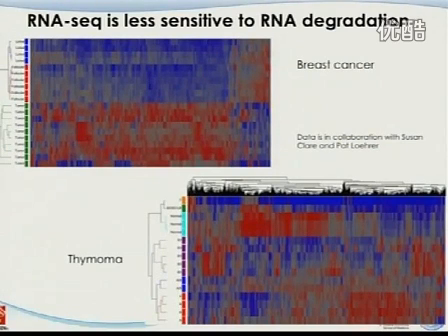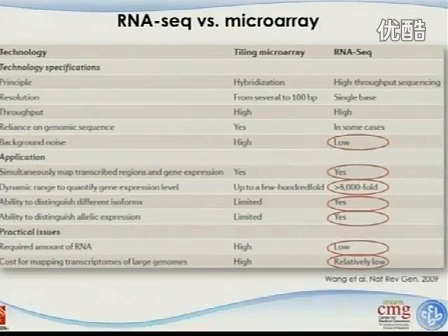And so these are for the human samples, and these are really, really difficult experiments to do. We know humans have a lot of variation, but the fact that RNA sequencing is so sensitive to detect these subtle differences is really striking. And we have some other examples in real patient samples, and the data really cluster together very tightly. So those are very interesting observations to look at.